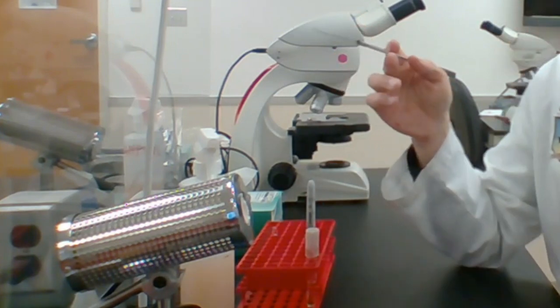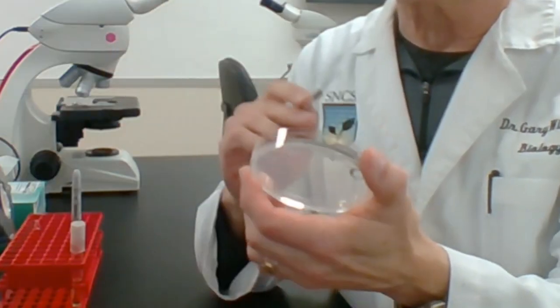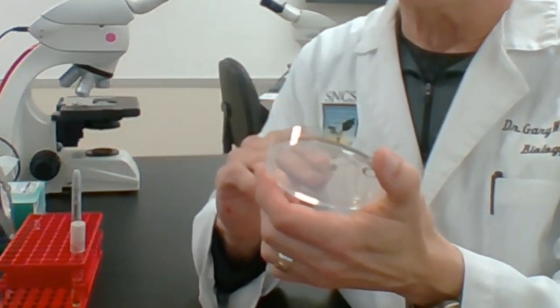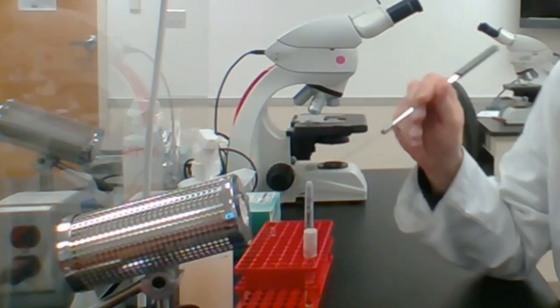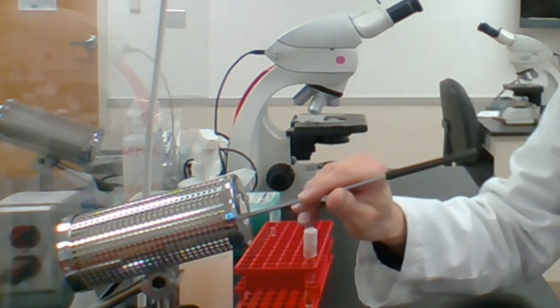During this time, the transfer tool with bacteria is held away from any contaminating surfaces. Then the lid of the plate is removed and the transfer tool is used to streak the inoculum onto the sterile agar plate. Once done, the lid is replaced and the transfer tool is sterilized.